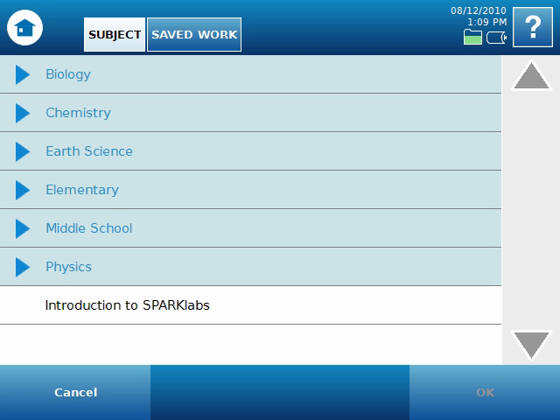For those of you following along with SparkView software, this is where you'll notice the first difference. In SparkView, selecting the Open button will open your computer's default open file browser window. Simply navigate to the file location on your computer and open the file as you would any other file type.